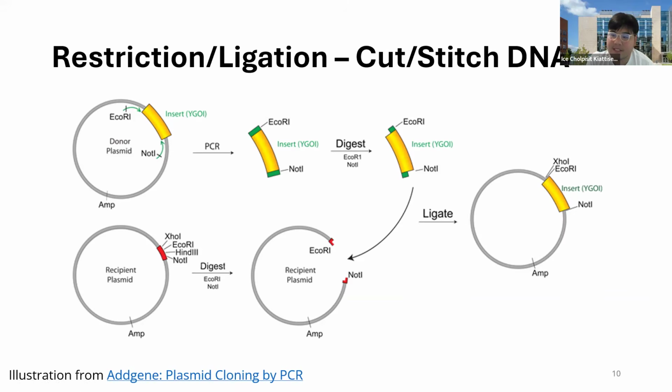So these are some lists of cloning, or manipulation of DNA, that we can use. I'm going to go very quickly about it, because we will do the actual in silico work on them again. But one type of cloning is by restriction and ligation. It's kind of old school. You just take the Lego pieces, cut them so that they have these kind of hinges, and then they can connect back specifically to whatever hinge or connector that they've got here.